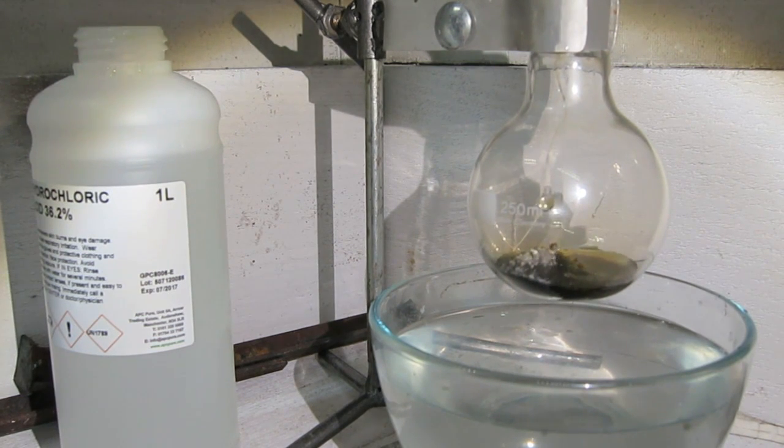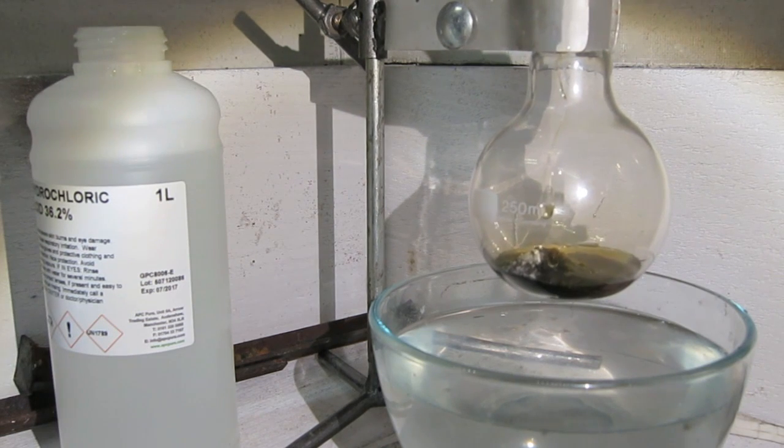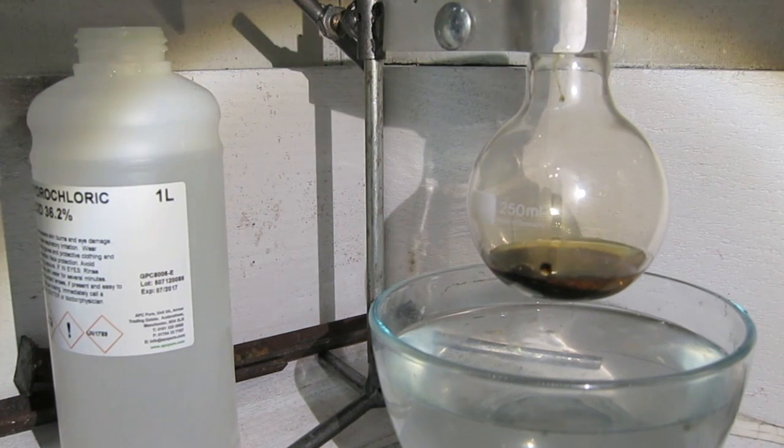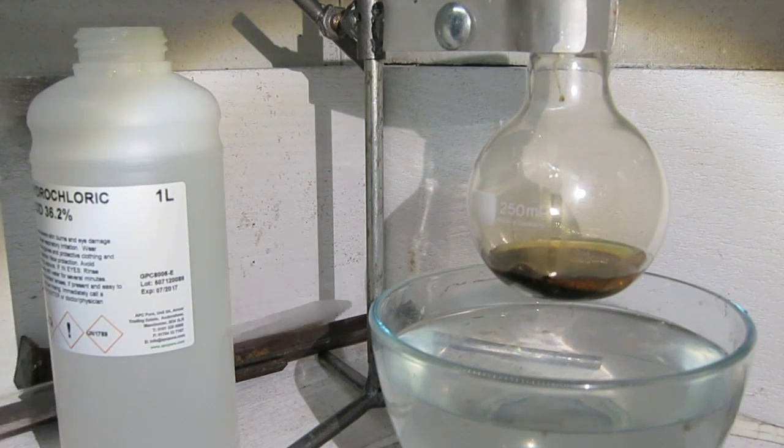So no reaction occurs yet. It requires some slow heating of the mixture before a reaction occurs. Okay, that's it. A little bit of brownish color, that's the light brownish color appearing.